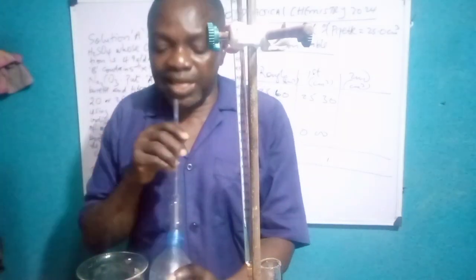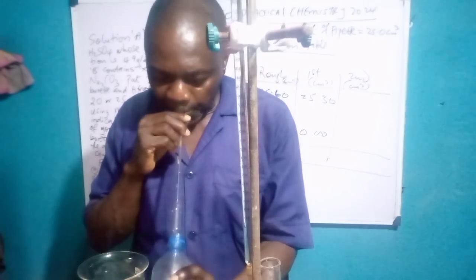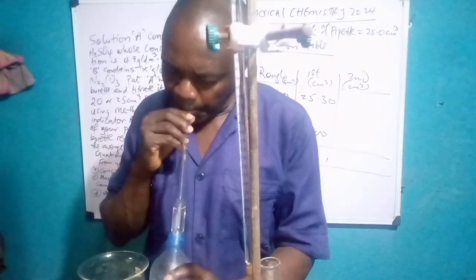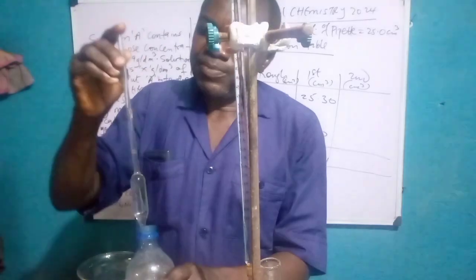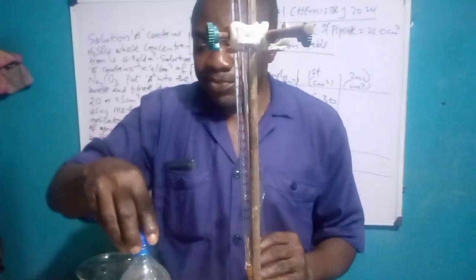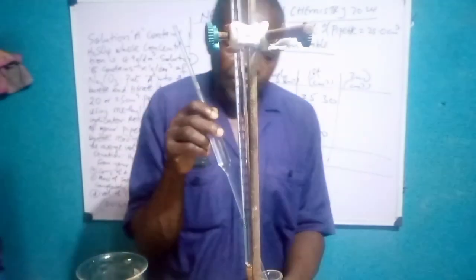How to draw an accurate titration table. Good. This is the last titration we are doing before we start calculations. So try and understand it properly as you progress.